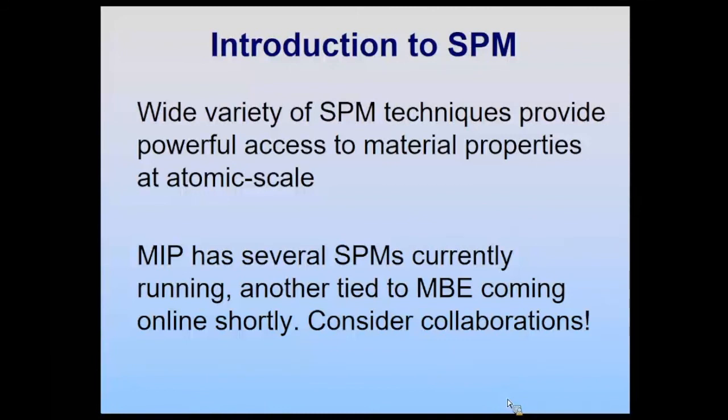With AFM, you can actually go and measure contact potential differences, which would certainly change if you had a charged impurity. So in some sense, that's a more direct measurement than the STM one. But I think in the long run, the STM is going to be the easier way to make those measurements.